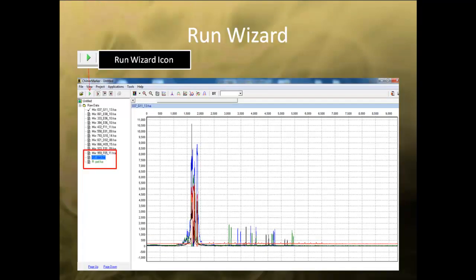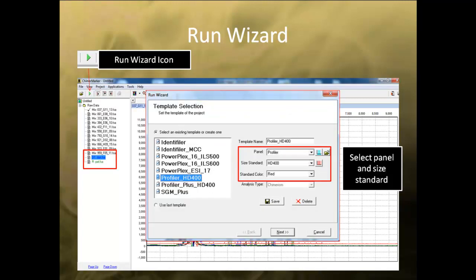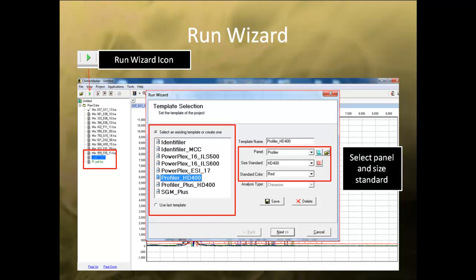Once the samples have been defined, click on the Run Wizard icon to bring up the settings for the analysis. In the first window, select the panel and size standard for the chemistry you are using. Or, if you are using a custom panel, use the panel editor to create a panel for your analysis. Details of custom panel creation are covered in Chapter 5 of the user manual. There are also templates on the left side for use with commonly used commercial human identity kits. For this example, I selected the Profiler HD400 template.